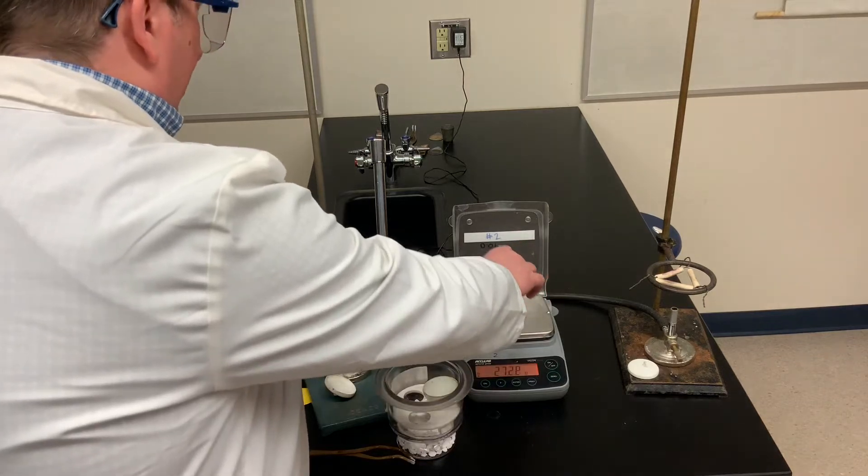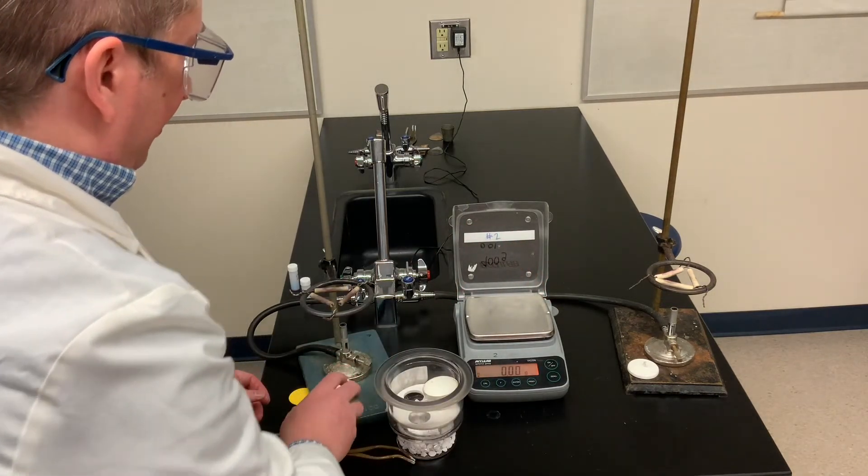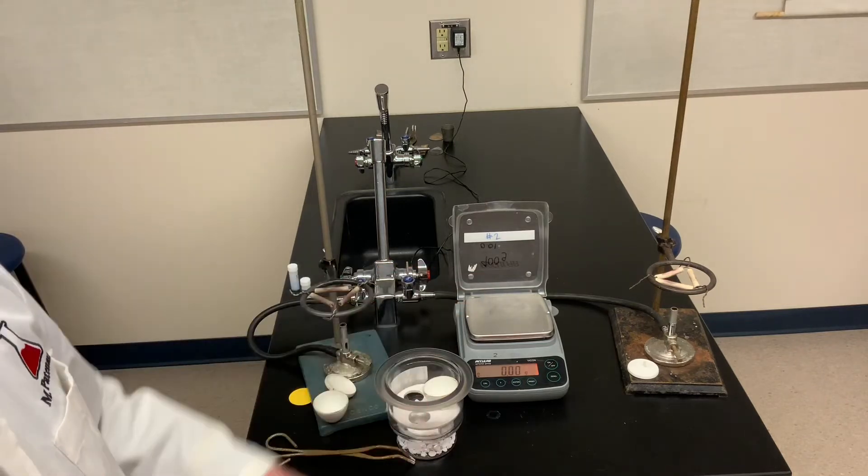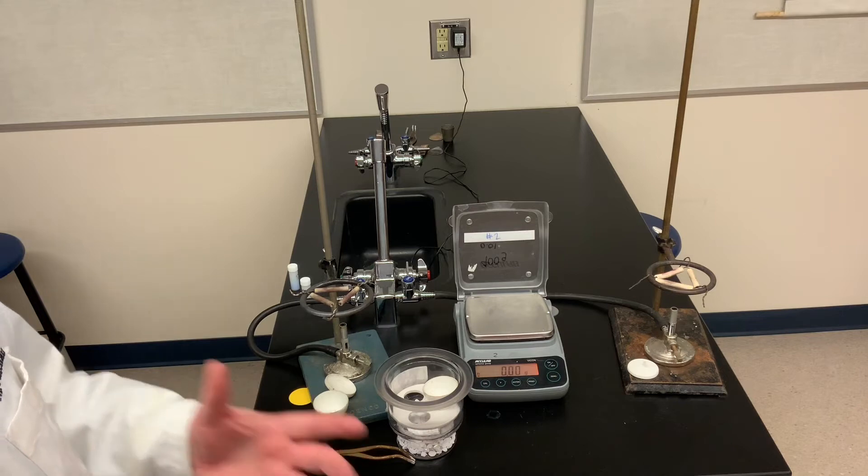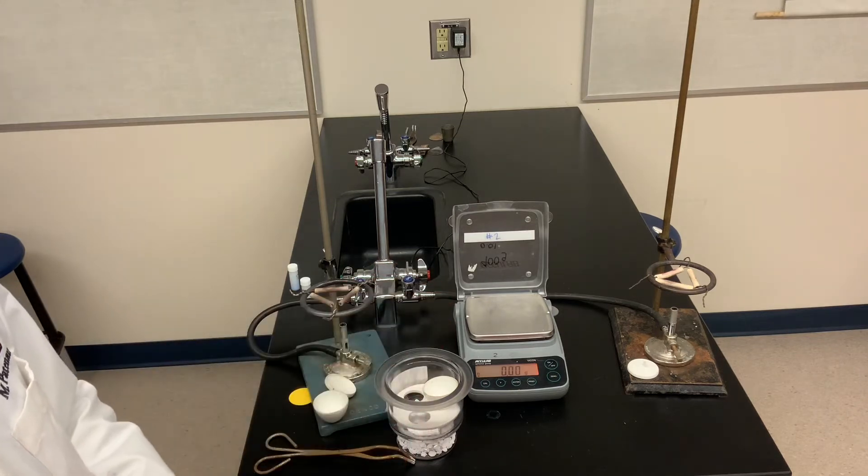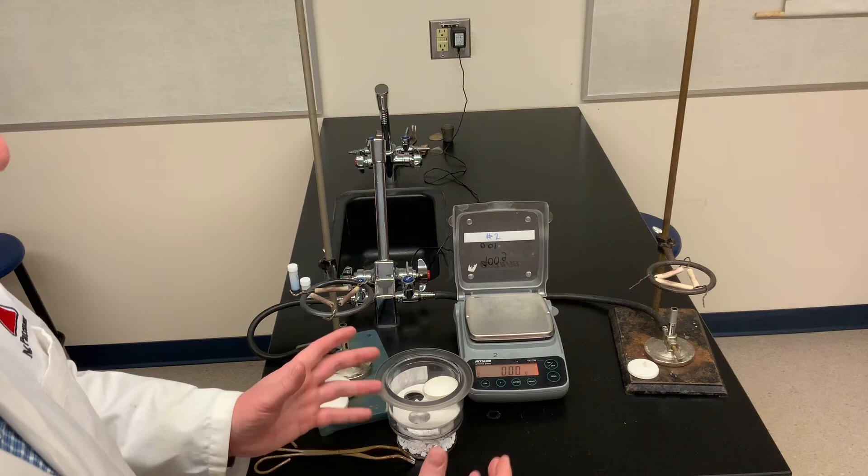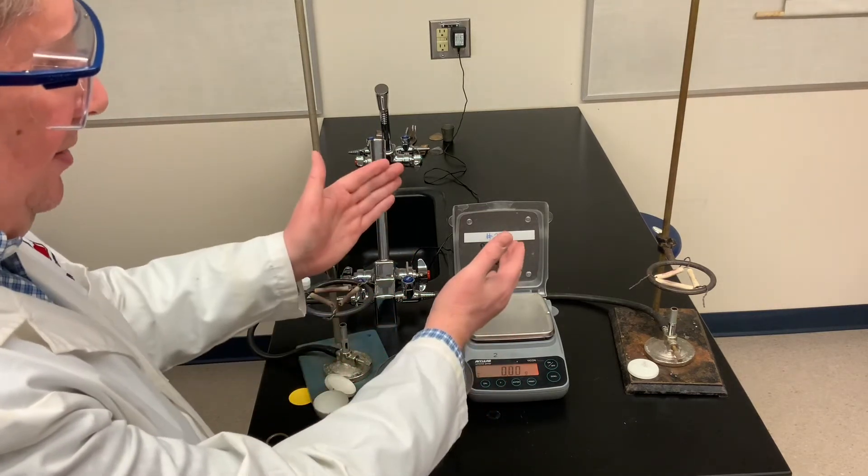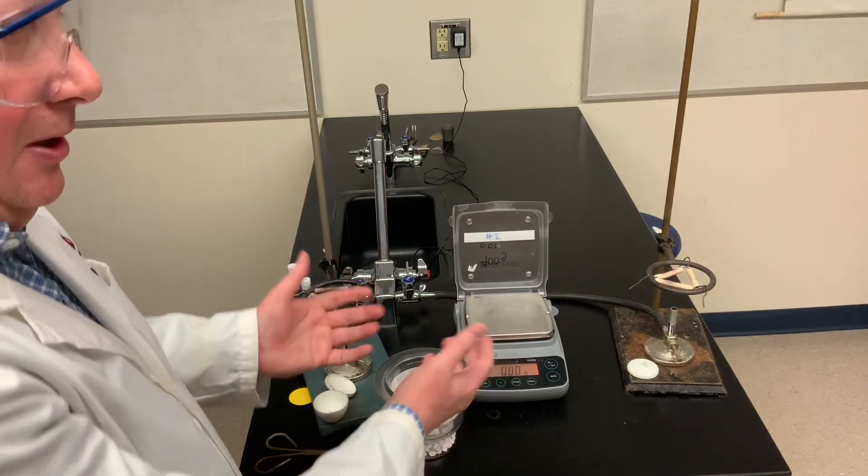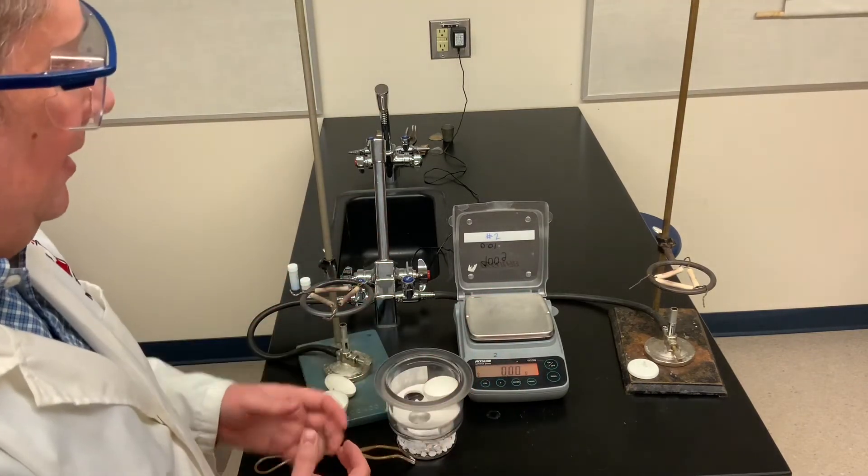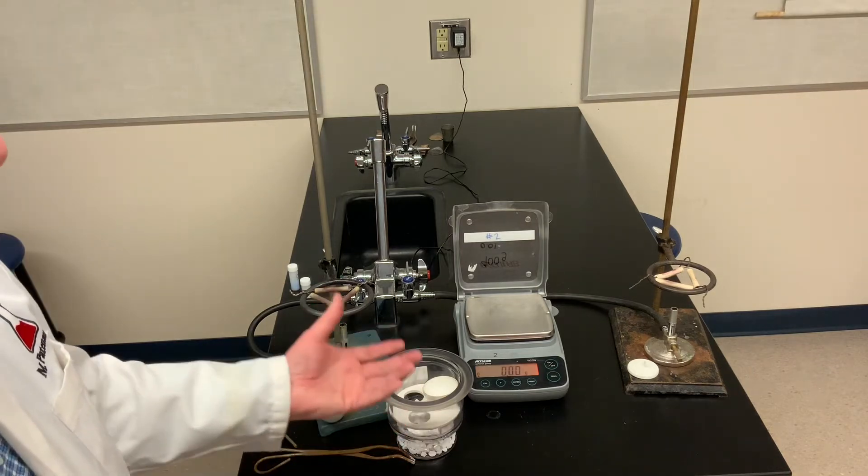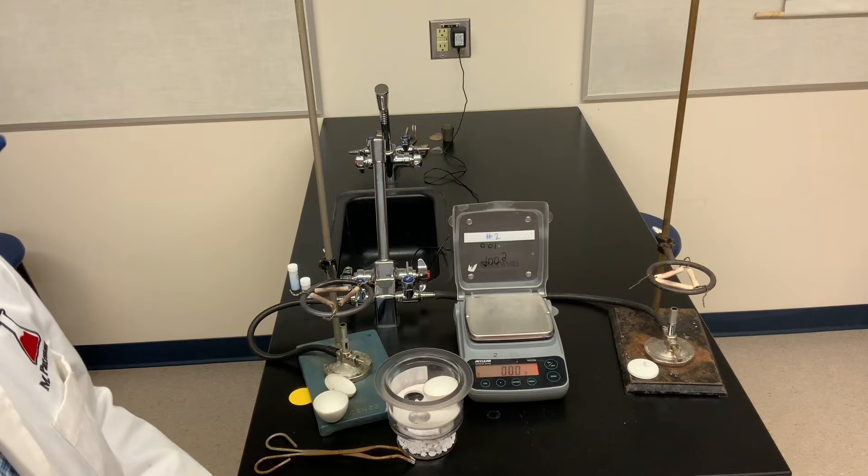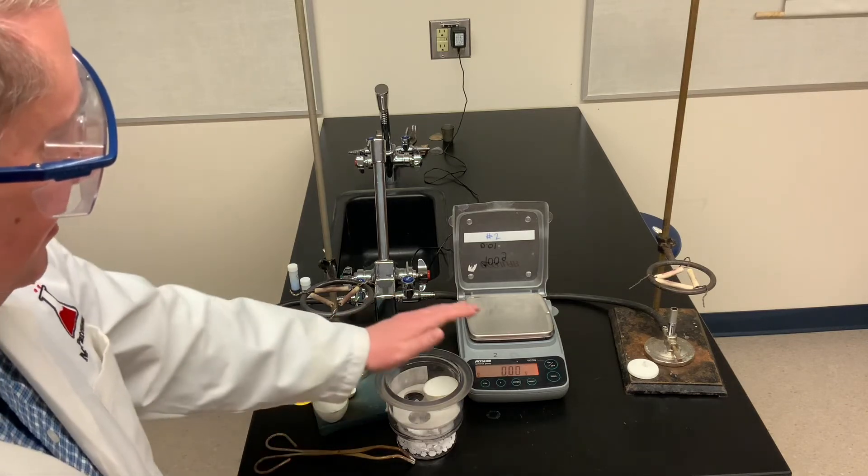Now you don't want to weigh a hot crucible for two reasons. Number one, when it's hot, you could damage the electronic balance. So don't put hot objects on electronic balances. But secondly, a hot object warms the air around it as well, and that warm air rises. The warm air rising lifts the object, gives it some buoyancy, and that could affect your mass reading. For a heavy object, that's a very small error. But for light objects, that could be significant.